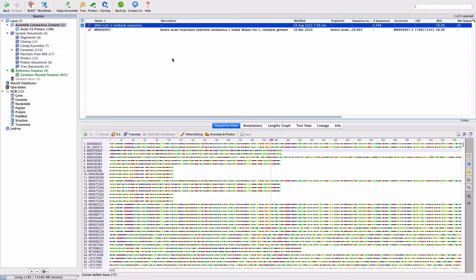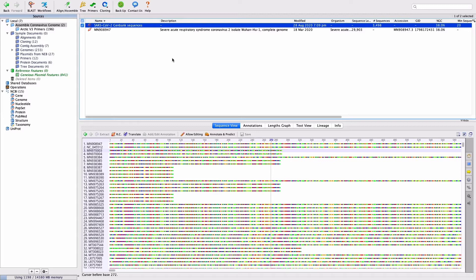Prior to assembly, it's important to remove poor quality bases and the PCR primers used to generate the tiled amplicons. If the primer binding site in the genome contains mismatches to the primer, variants in those regions may be missed if the primer sequences are not removed prior to assembly and variant calling. The BB Duck plugin, with some modified settings, can be used to do both the quality trimming and the removal of amplicon primers in a single step.